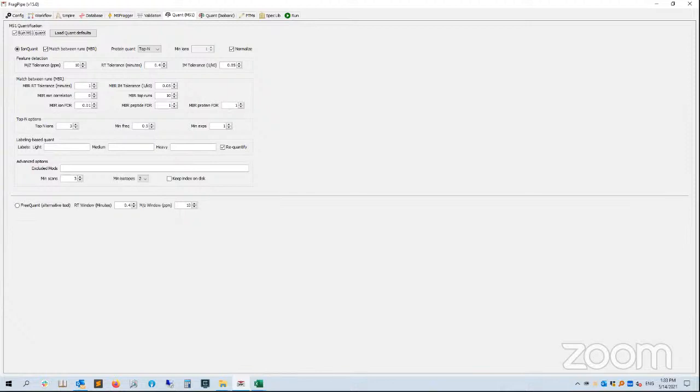Now, single cell proteomics is different data, or sparse data sets in general. So we did find that there is a value in potentially going from 1% to say 2% ion level false discovery rate, maybe even 3% in some of the single cell data sets, if your downstream analysis can tolerate an increase in the number of false quantifications. Because in the gray zone, especially in single cell, there are a lot of really low quality ions.